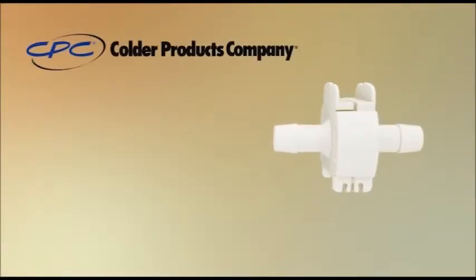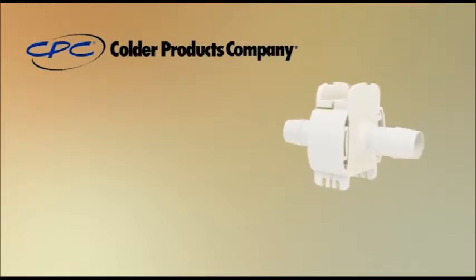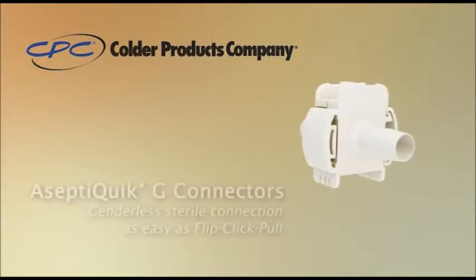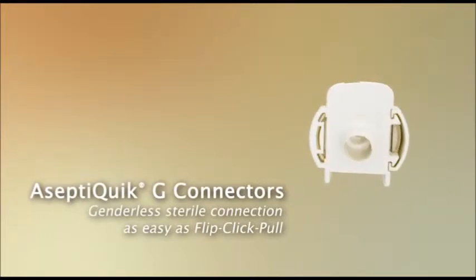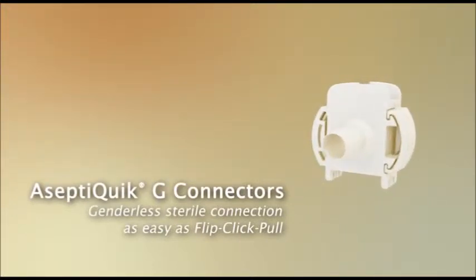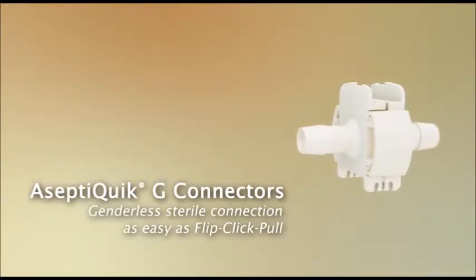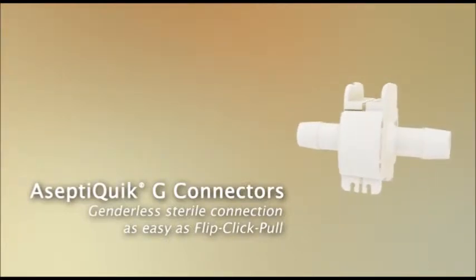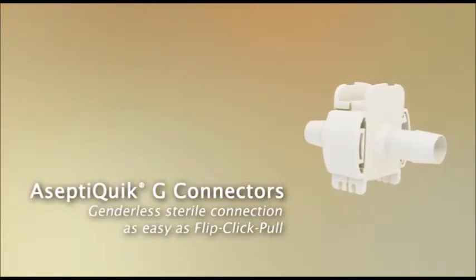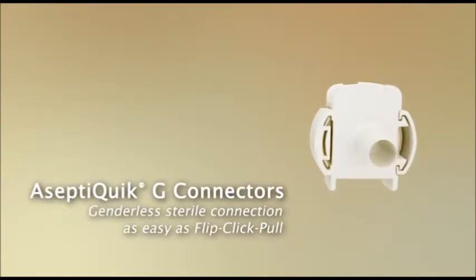AseptiQuik G Connector. For applications where reliability and sterility are a must, connect with Colder. Colder Products Company advances sterile fluid transfer with the introduction of the genderless AseptiQuik G sterile connector for quarter inch to three quarter inch applications. The innovative flip-click-pull design provides the ease of use and reliability expected from the leader in single use connection technology.